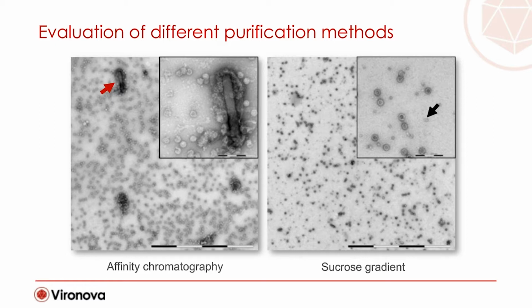So there are a lot of parameters that can influence the quality of your product, and which can be monitored using electron microscopy. So after the poll question session that will start right now, Martin will let us know more about the MiniTEM system and how it can be helpful with all the automation that has been built into the system. So I give the word to you, Joanna. Thank you very much, Josefina.